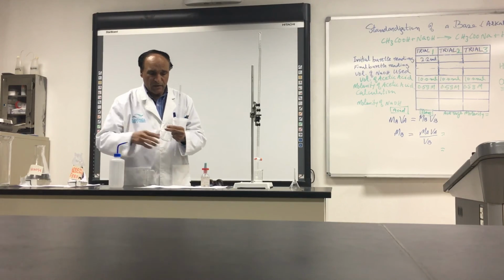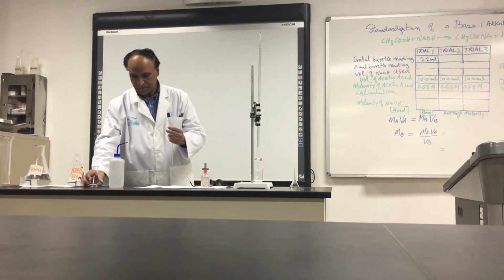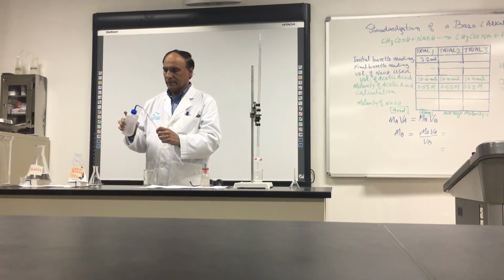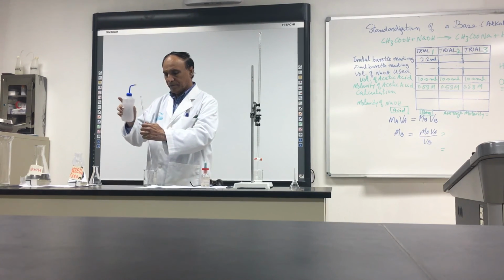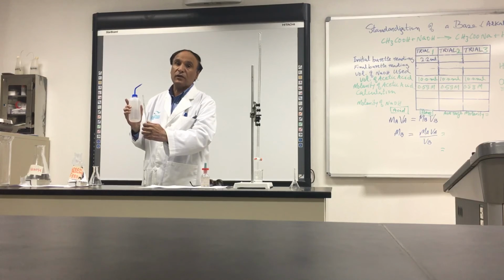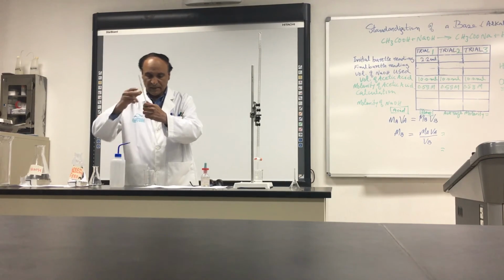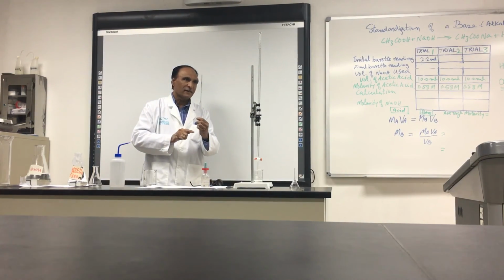The other student will take these two things and he will wash them. How will he wash? First of all, he will wash this one with the water. This is what the second student is doing. So he's washing this one. There is water; to remove the water, but still there is water.